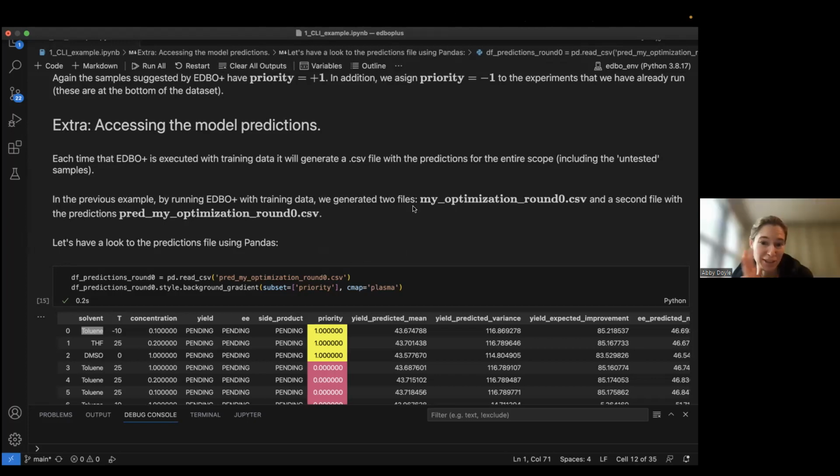Sorry to jump in, but I think you can cite the Jack's paper and maybe list the web app, and then probably in the supporting information, you'd want to have the CSV files for the different rounds of experimentation that were prioritized.